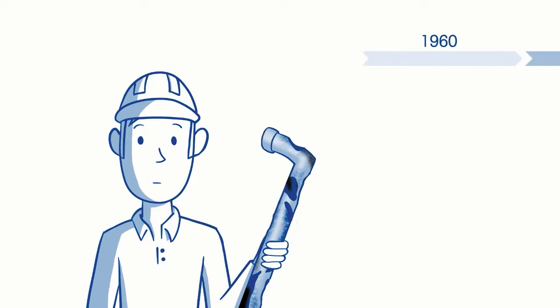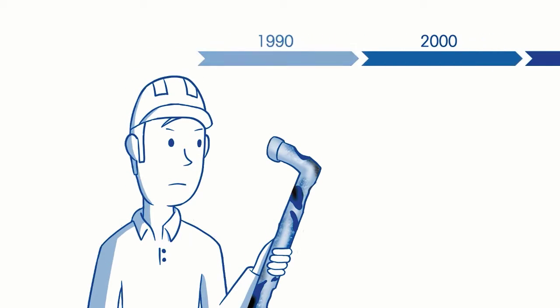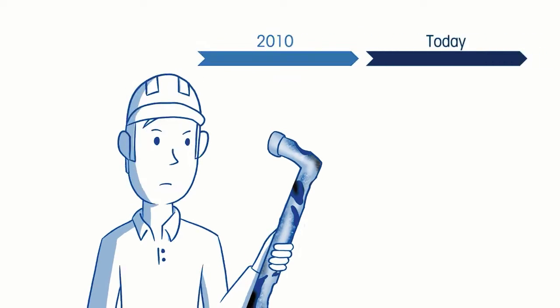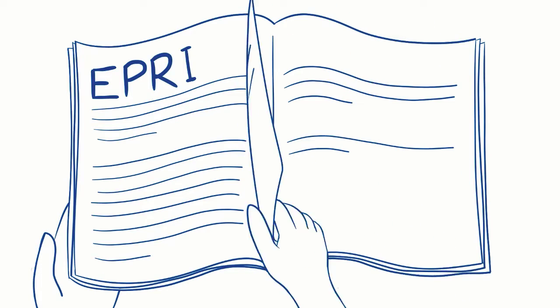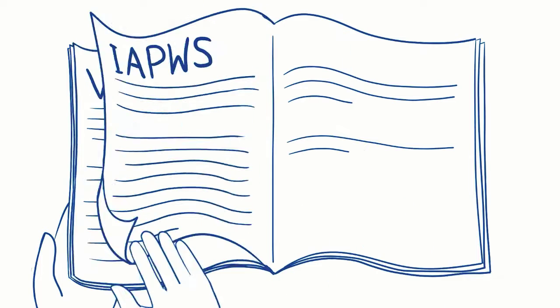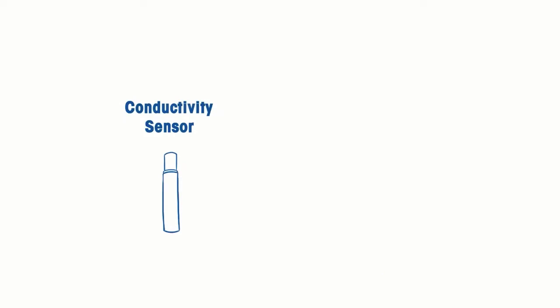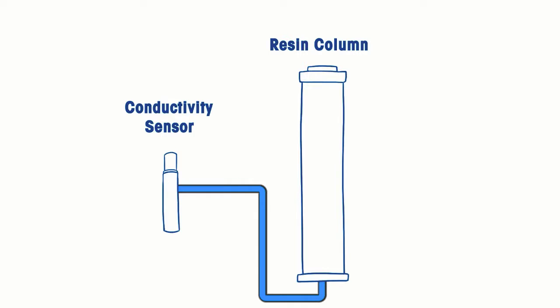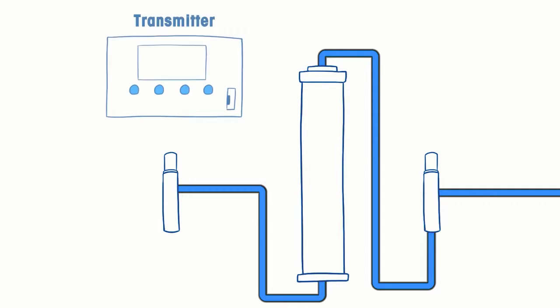For decades, power plants have been trying to control chloride and sulfate contamination that can cause corrosion and other damage to expensive equipment. Concentration limits of 2 to 3 ppb for chloride and sulfate are even specified in industry guidelines. As a cost-effective substitute for ppb level measurement, plant chemists have relied on cation conductivity to monitor corrosion.